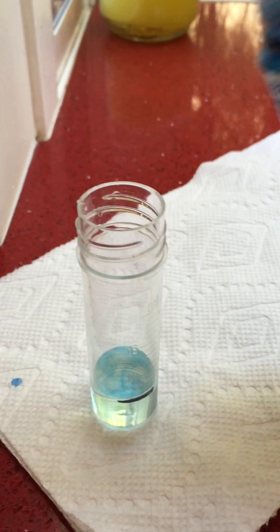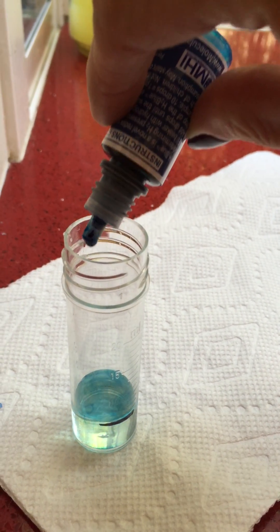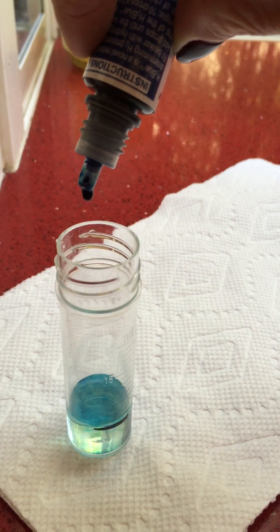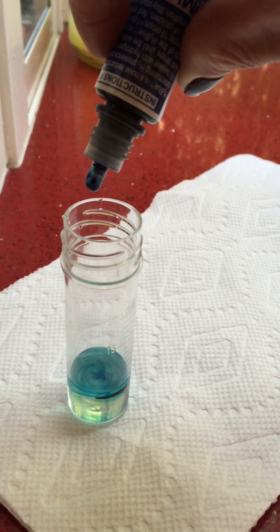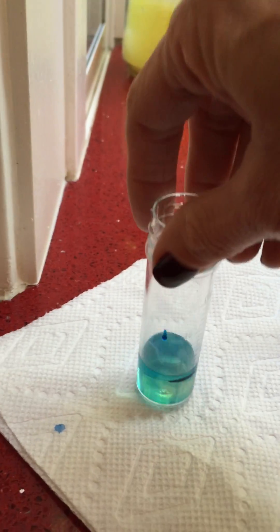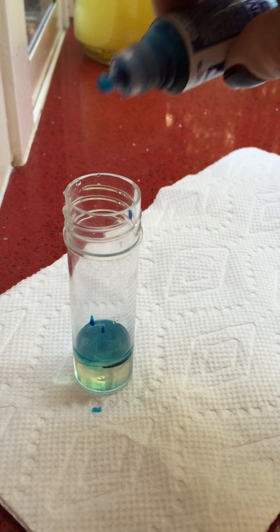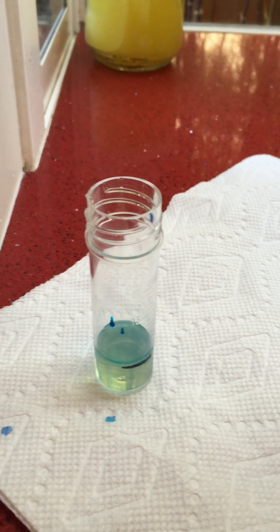So let's see how many drops we can get before it stops turning white. One, two, three, four, five, six, seven, eight, nine, ten, eleven — let's just mix that up a little, make sure — okay, still turning white, still neutralizing the free radicals.